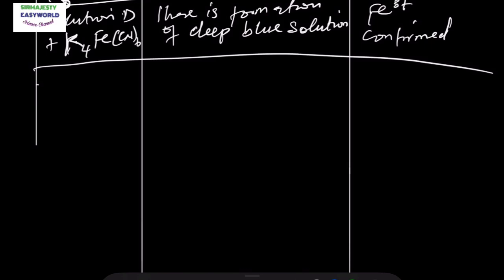So that's it for the analysis of lead 2 trioxonitrate 5 and iron 3 chloride. The only thing is that the test for chloride might not be easy. That's another emphasis. Why are we not looking at the test for chloride ion? It might not be an easy approach, because if you do it practically, you wouldn't observe what is theoretically expected from the results. What I mean is this: if you want to test for chloride ion, maybe let's use yellow.